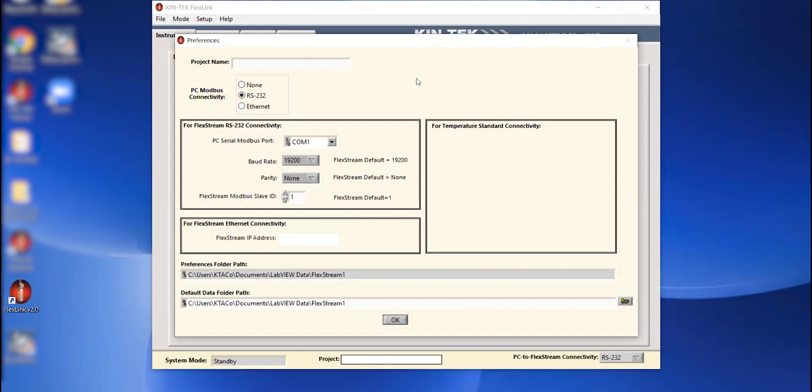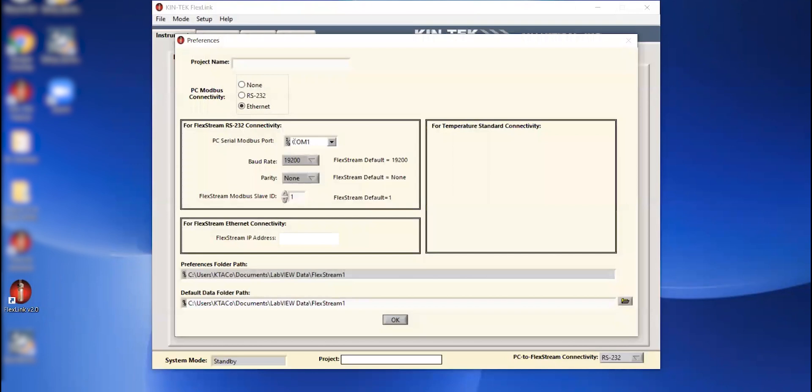Since I am setting this up remotely and I want to operate it remotely, I'm going to go ahead and use the ethernet connection. If you were standing right next to the instrument and wanted to use the laptop, you can do the RS-232 connection. And then you would actually define your COM port that you want to communicate through.